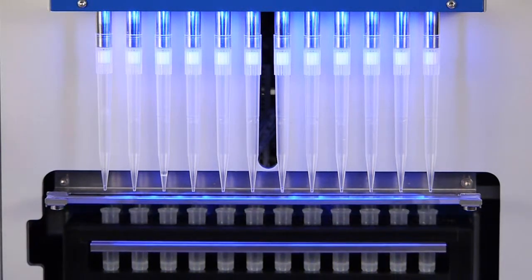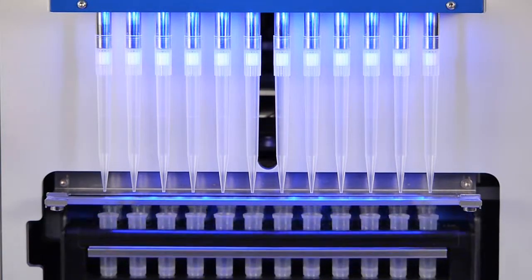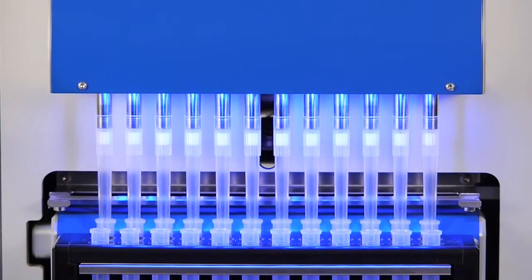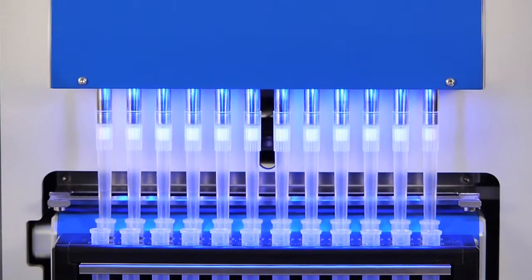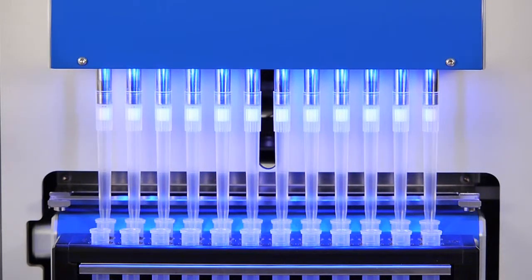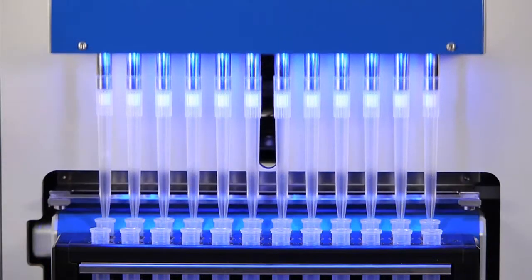In order to remove residual impurities that may have remained in the pellets, and to further purify the DNA, wash buffer 1 is added to the reaction tubes. After resuspending the pellet, a second magnetic separation step follows. A total of three consecutive washing and separation steps are carried out, with wash buffers 1, 2, and 3.